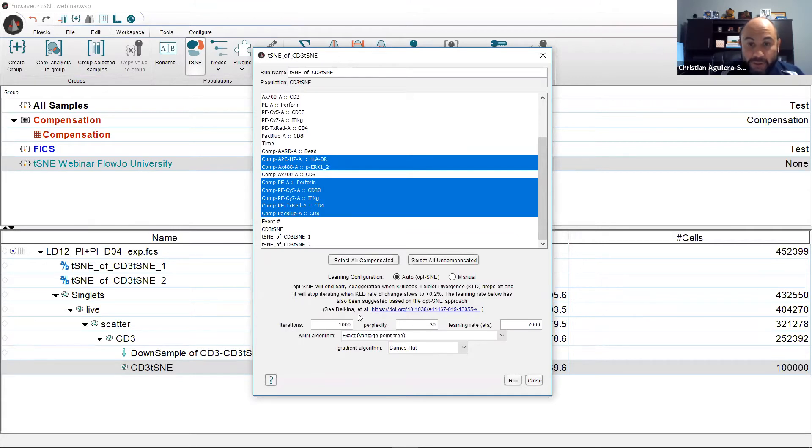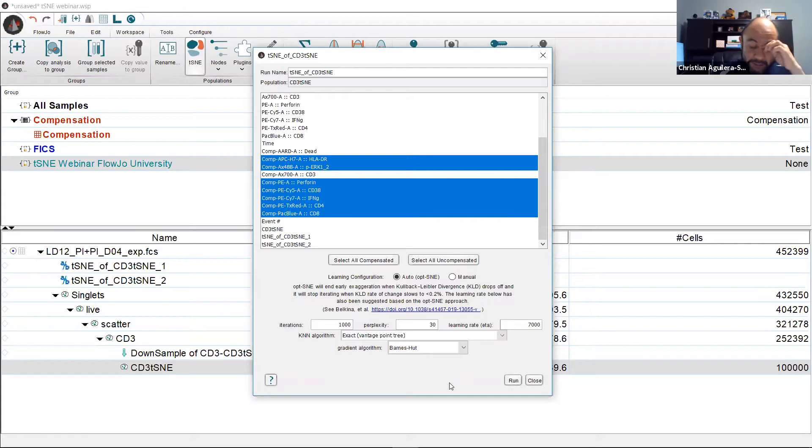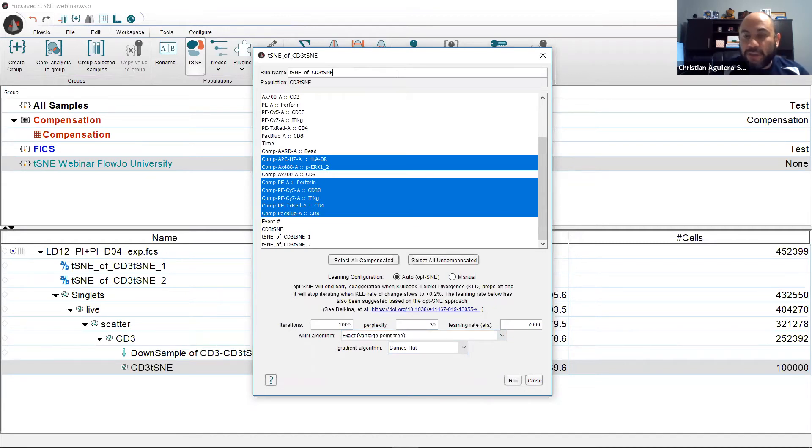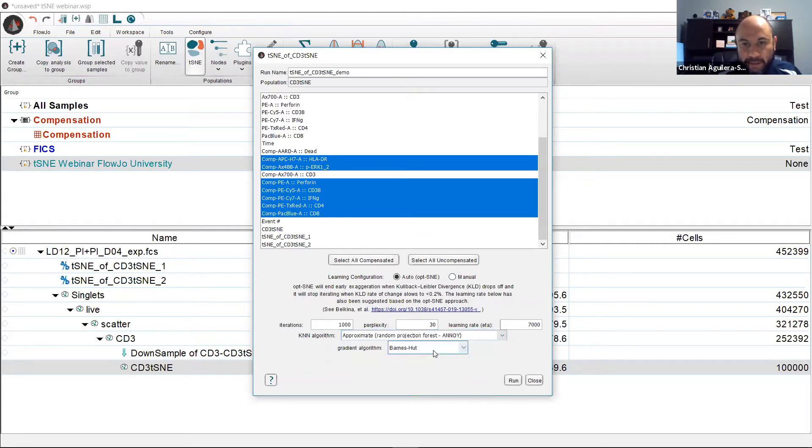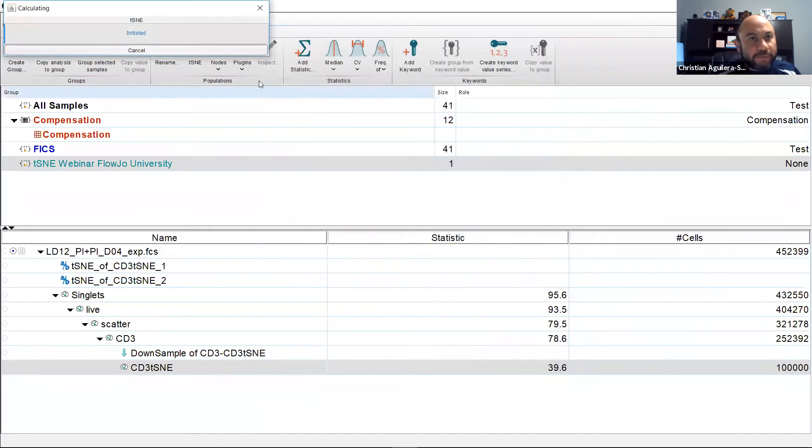I will describe all of the tunables while the algorithm is doing its calculations. But for now let me click on run and let the algorithm do its thing. Also, please go ahead and name the run as you would like. We could try this and put as demo. I'm going to click these options here and click on run.